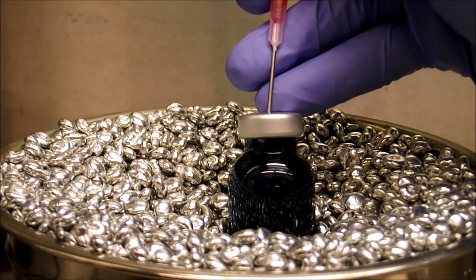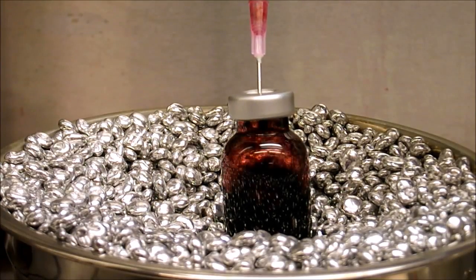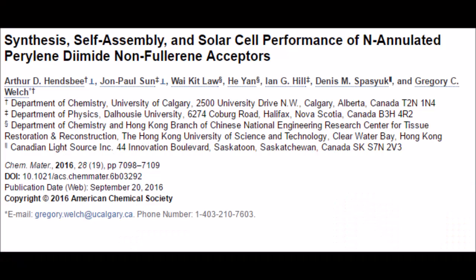Hello and welcome to WelchLab Chemistry. Today we will be undertaking the final palladium-catalyzed reductive homo-coupling reaction to make an N-annulated perylene diimide dimer, as described in our Chemistry of Materials paper, which can be found in the video description.